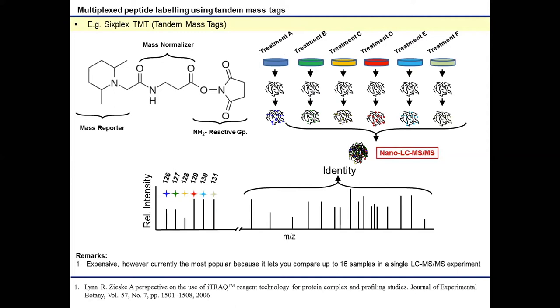And most importantly, from a quantification standpoint, the variability, if you do a label-free approach, is much higher compared to the multiplex approach, where when there is much higher variability, subtle changes in quantification might not be visualized in label-free approaches. But here, those subtle changes can be monitored very cleanly, because everything will be analyzed during the same LC-MS/MS analysis.